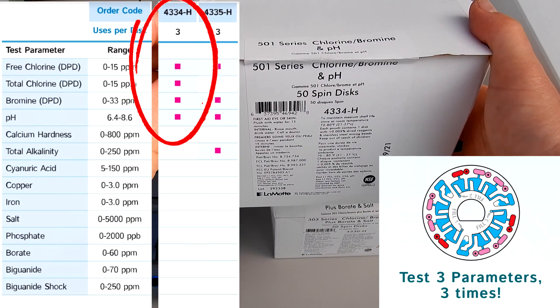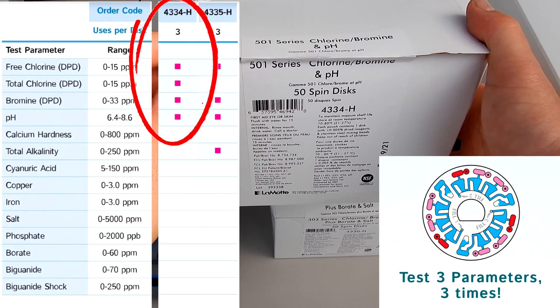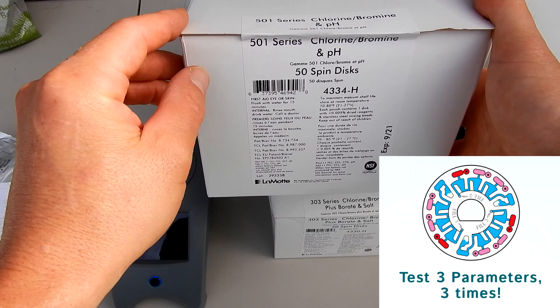Next is the 501 series, the 4334-H. It does chlorine and bromine, total chlorine, and pH. This is a three-use disc — it tests three factors and you can reuse the disc three times.